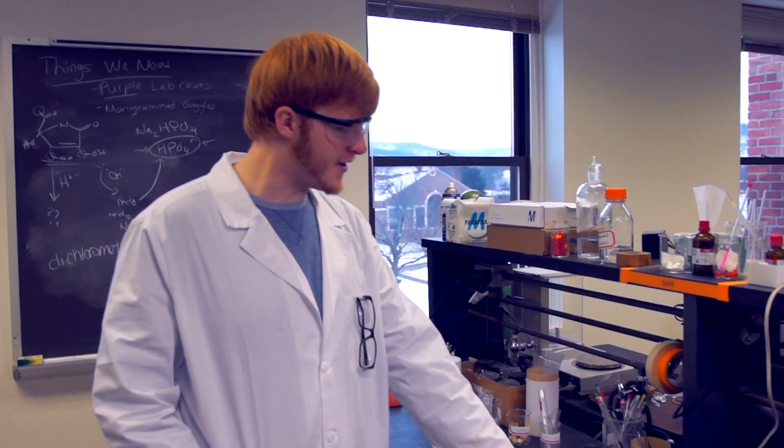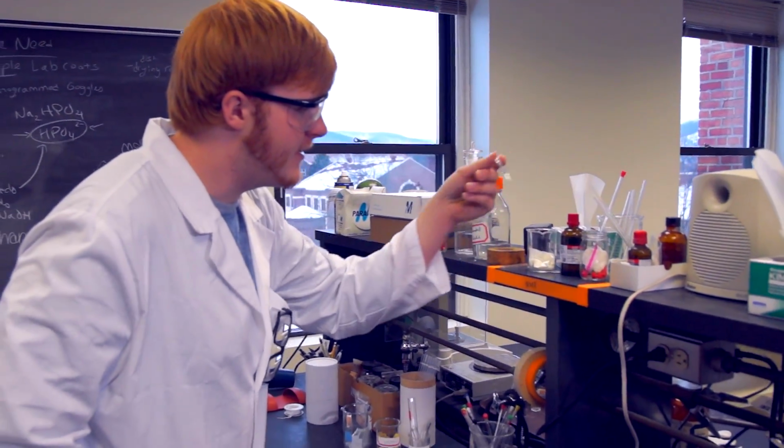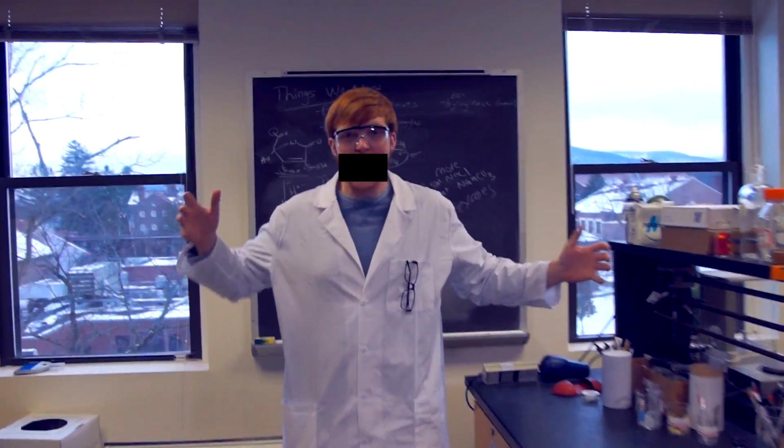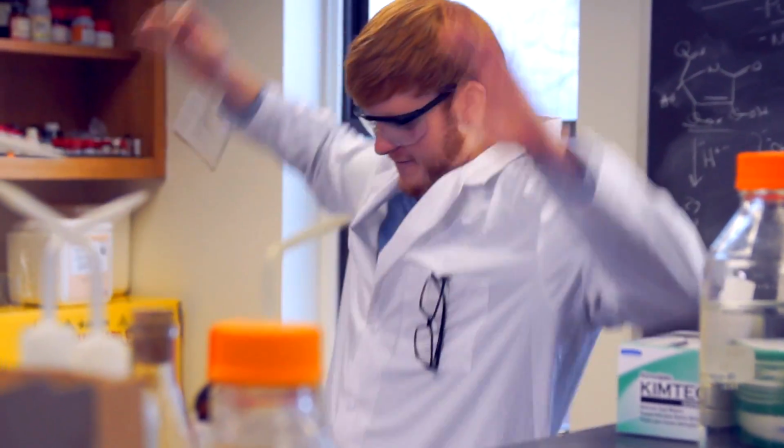Oh hey, a letter. Dear Mitch, do an NMR. Love, Dr. Helmy. He's great. Let's see. To do an NMR, I need an NMR tube. Oh, here's one. Oh! Okay, I can't mess this up again. I gotta do this for Dr. Helmy. Let's get another tube. Okay, I got it.